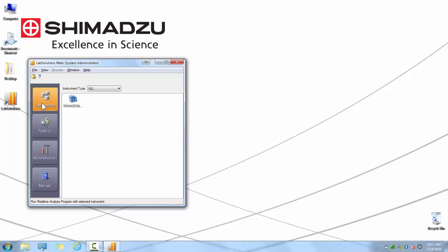Once the main administrative screen has appeared, you will see four tiles on the left-hand side: Instruments, Postrun, Administration, and Manual.